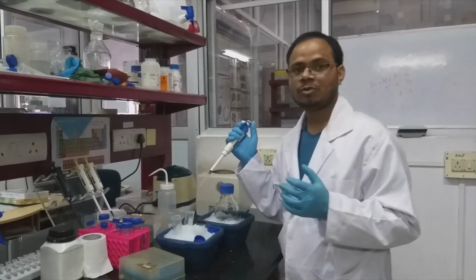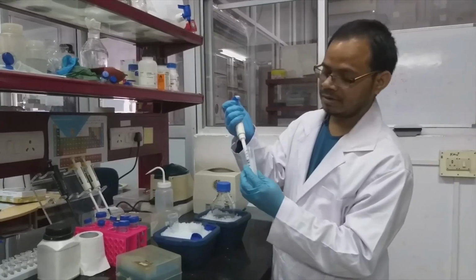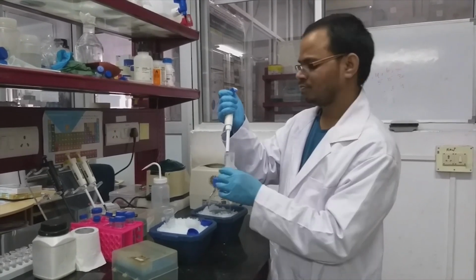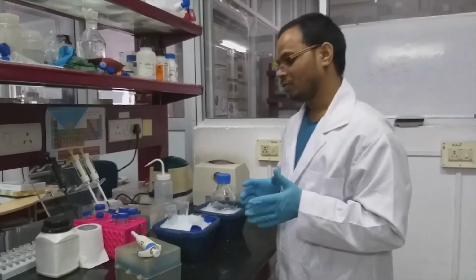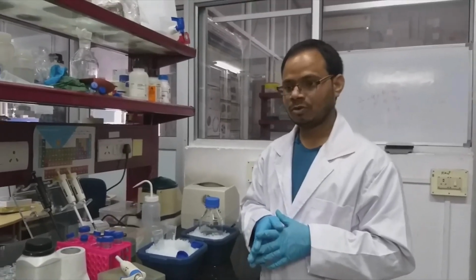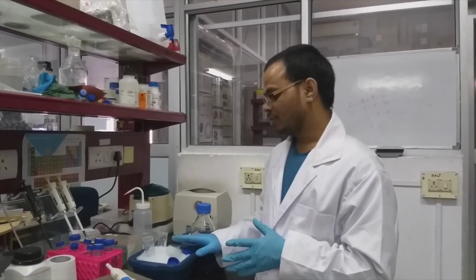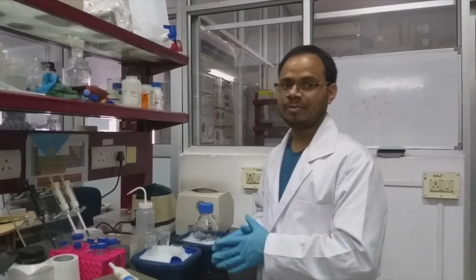So while doing this, make sure that there are no clumps in the cell pellet, and always keep it on ice. So why are we keeping it on ice? Here we have to remember most of the proteins are heat sensitive. So to prevent degradation or dysfunction of the proteins, we'll use ice as a medium. If you keep it on ice, at least they will be stable.